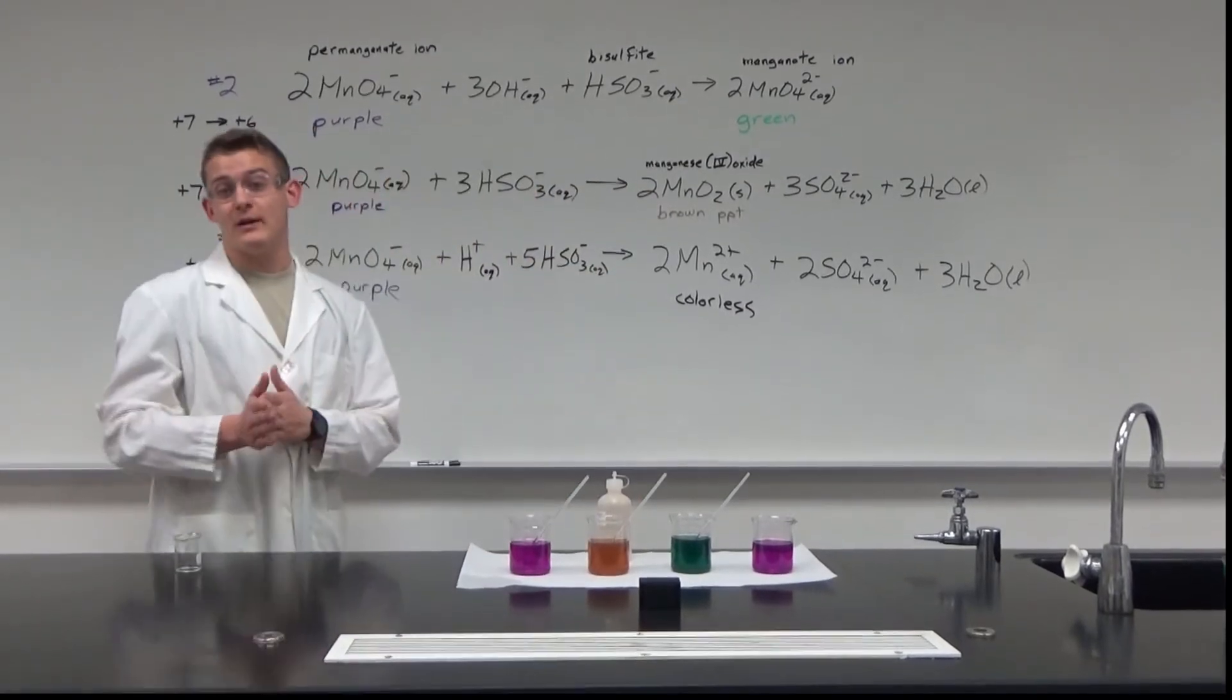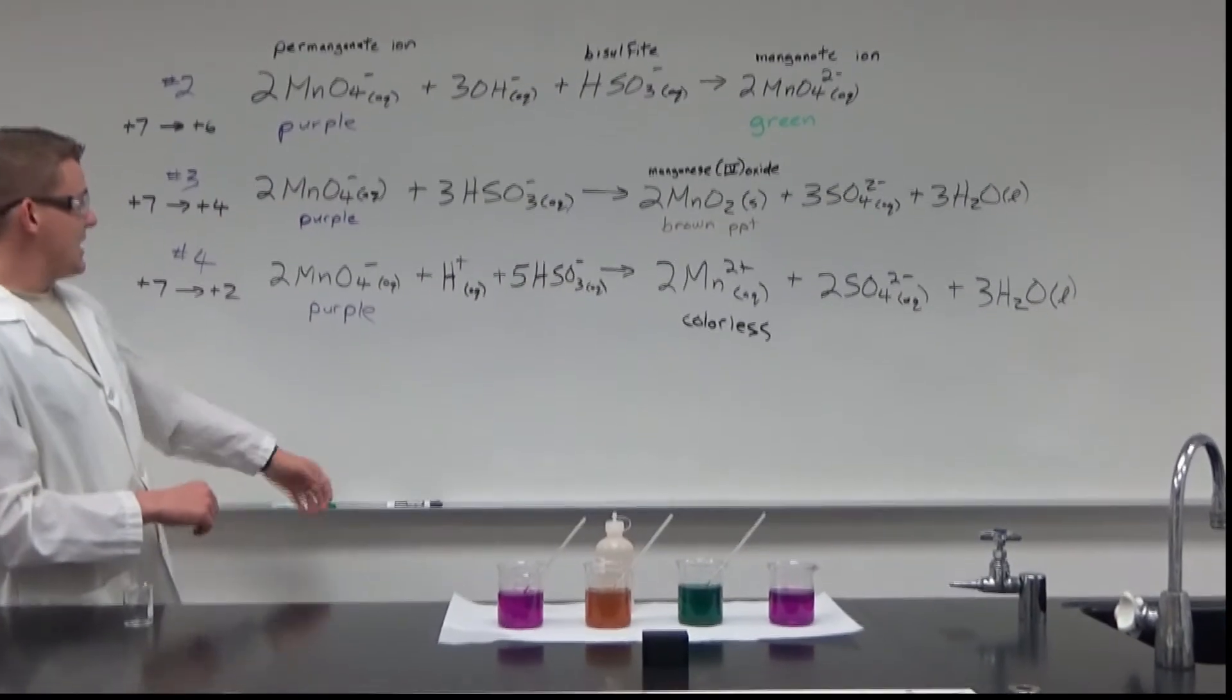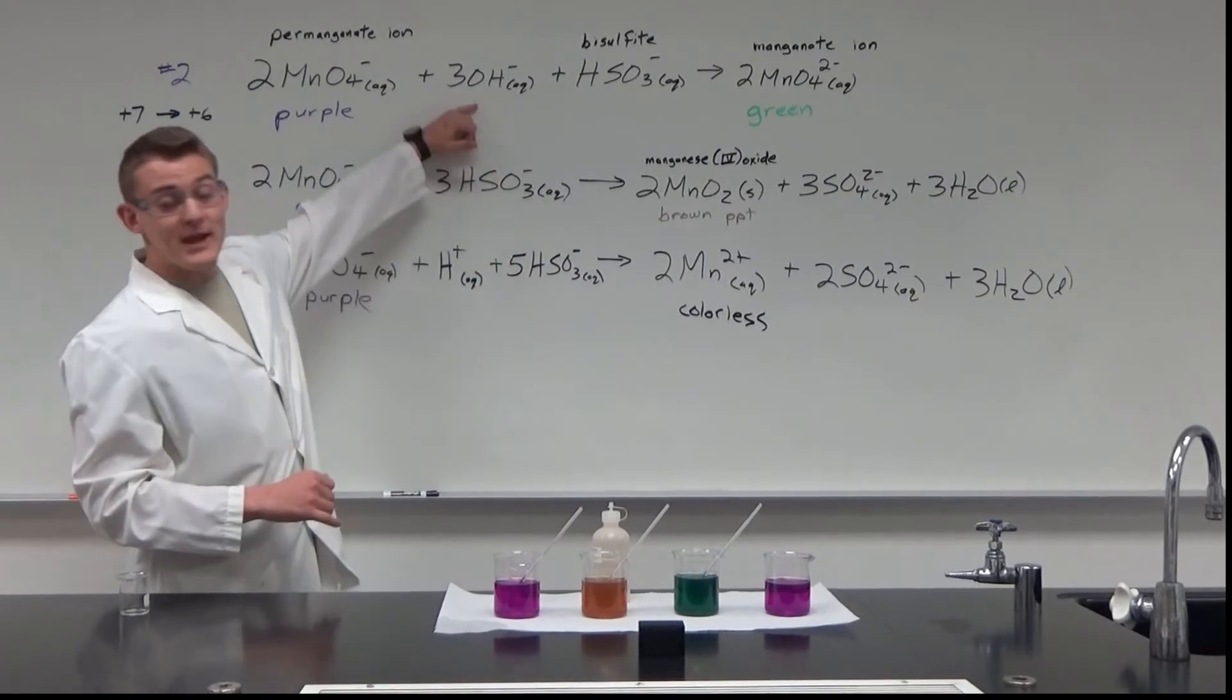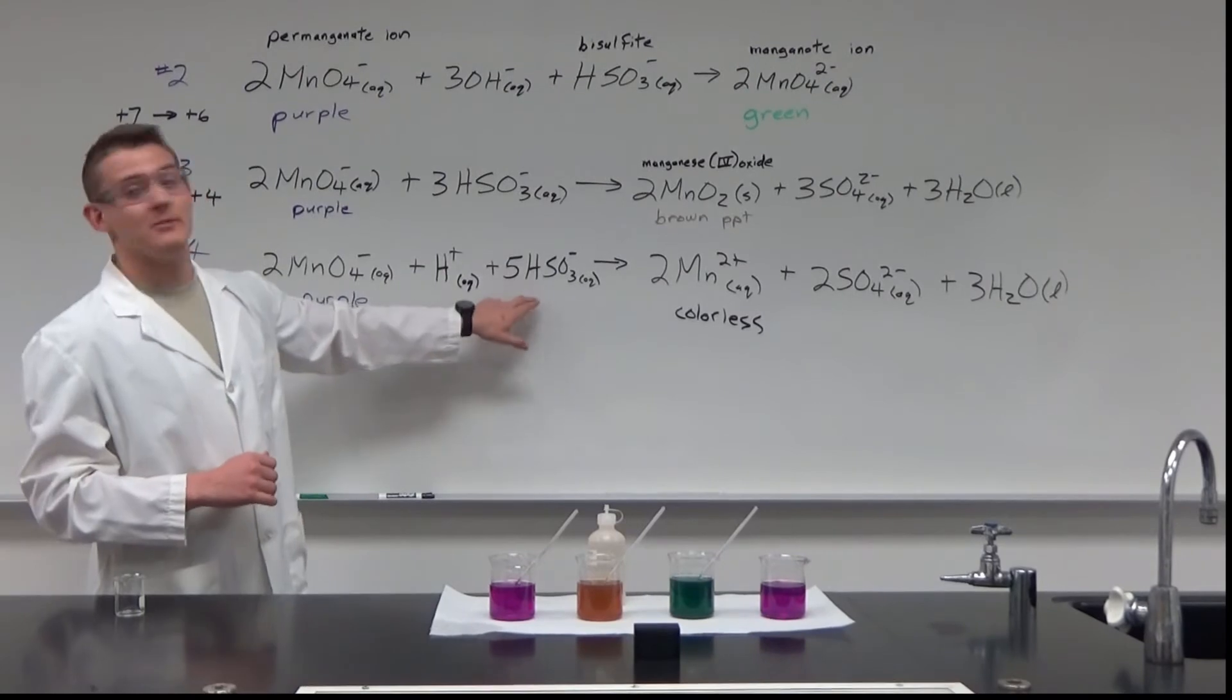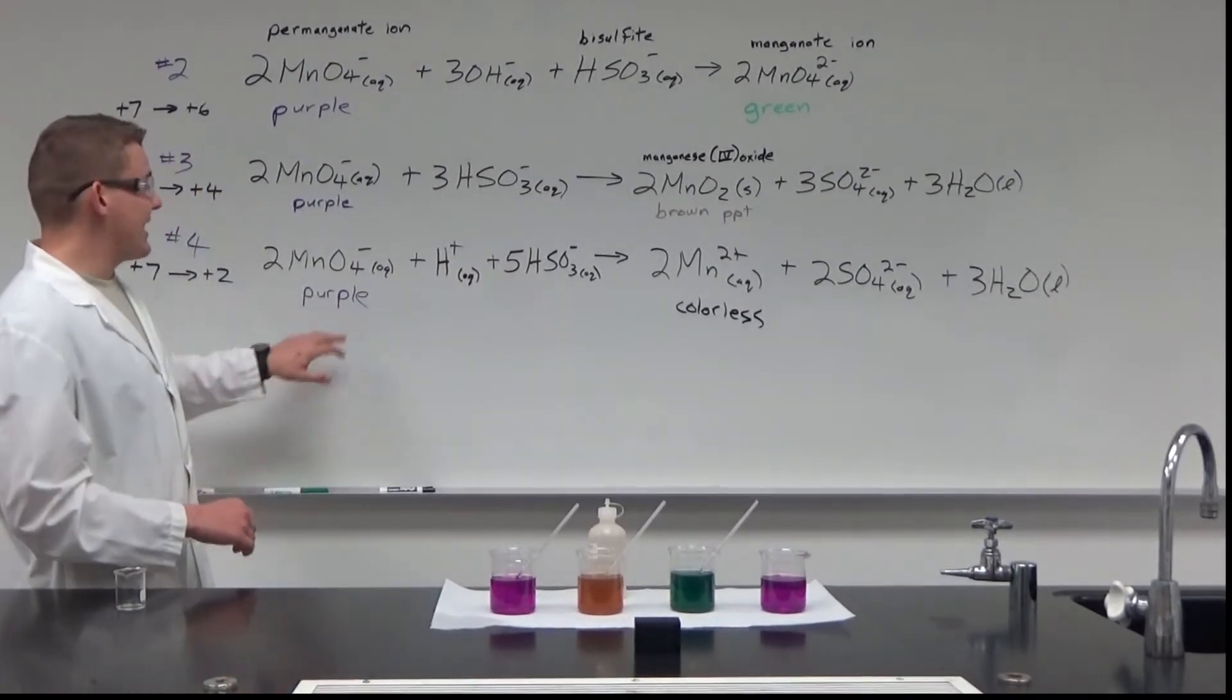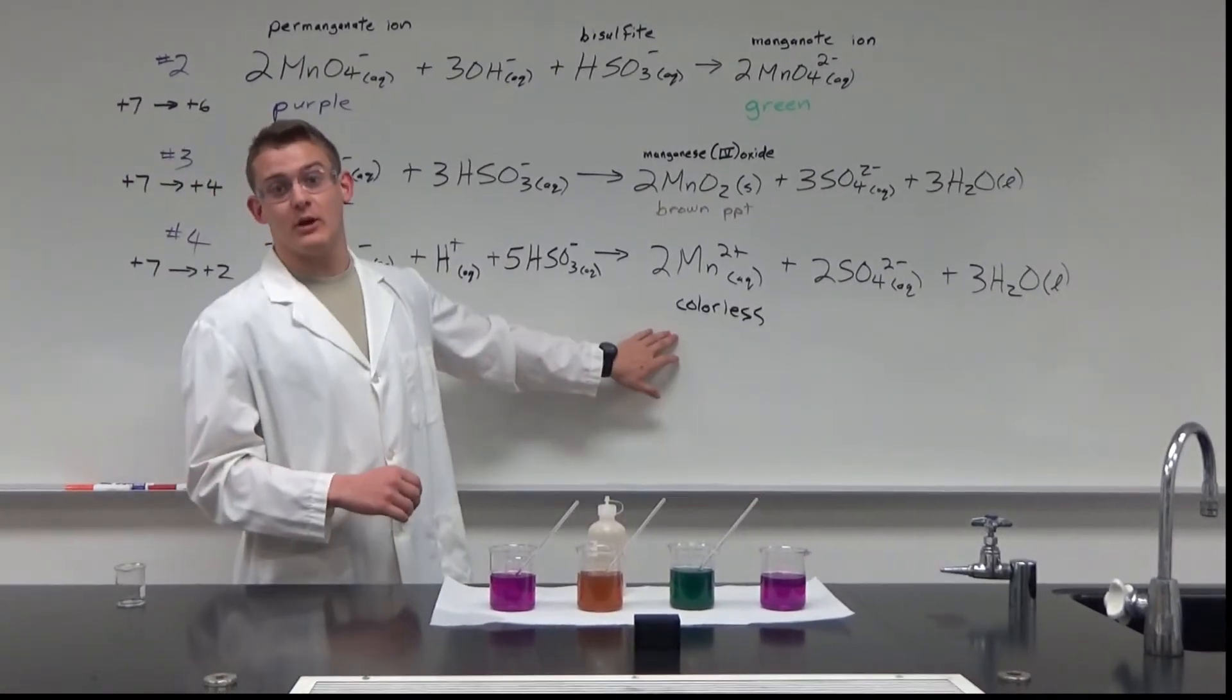And then for the final reaction, what we're going to be doing is instead of adding base like we did for the first reaction, we're going to go ahead and add acid along with the bisulfite. So that should give us from the purple to a colorless solution.